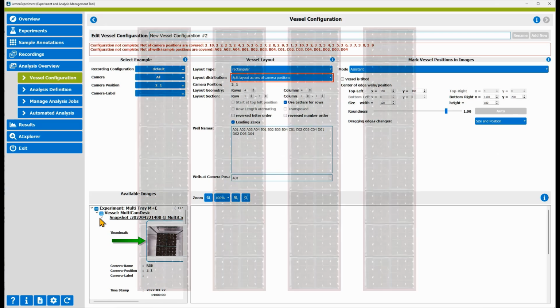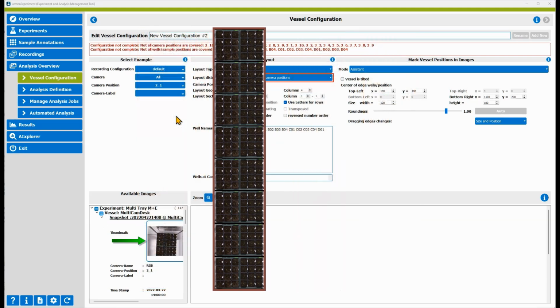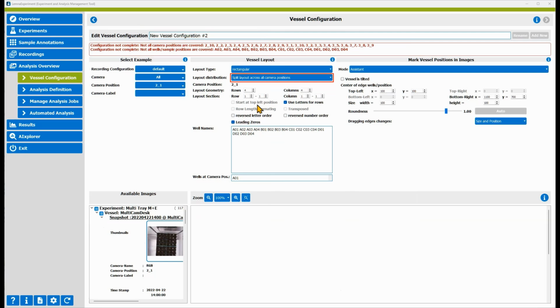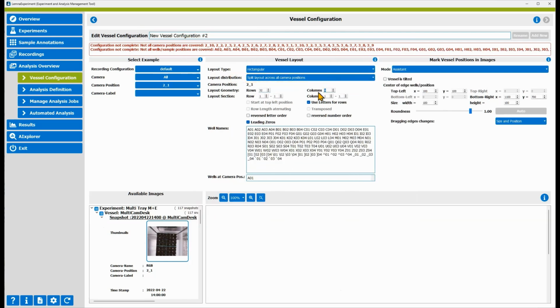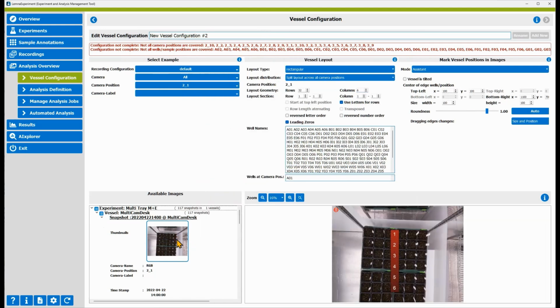In these images here we have 4 tables with 8 trays each. Each tray has 4 by 6 plants. Let's focus on one table with 8 trays. Then we would have 32 rows by 6 columns. In the first image, we see 6 rows. So we have rows 1 to 6 and columns 1 to 6.